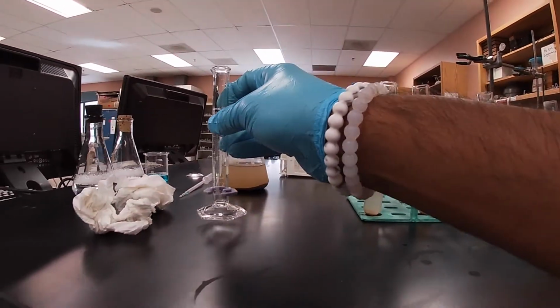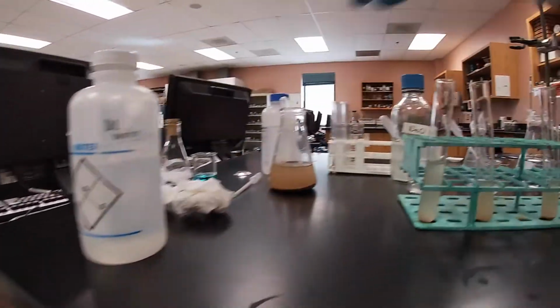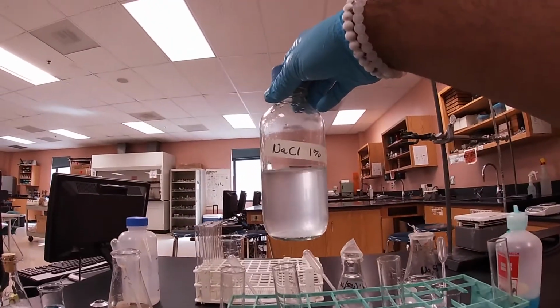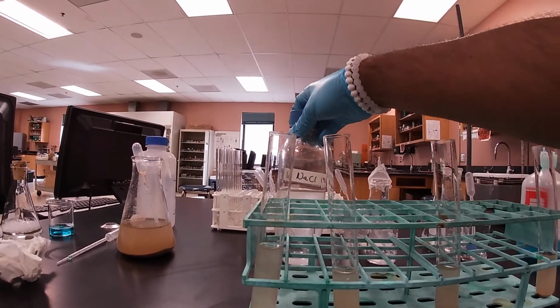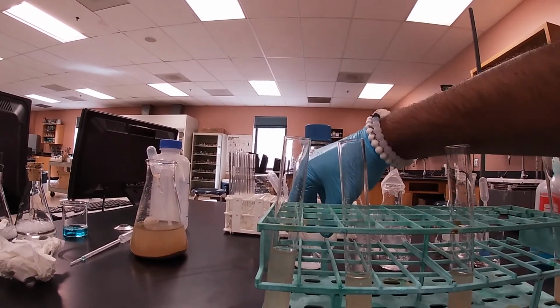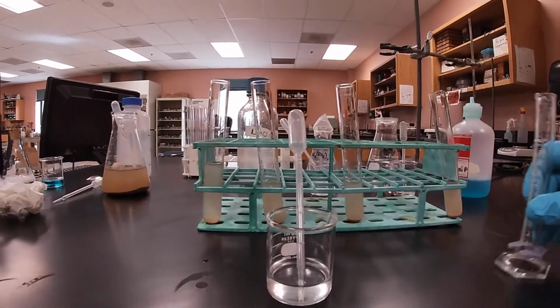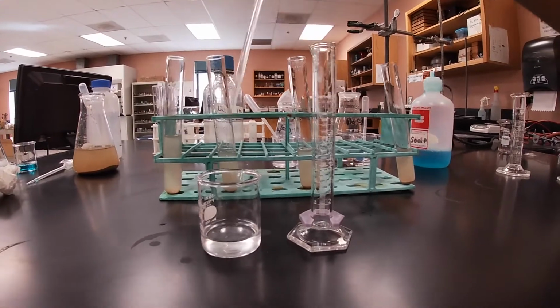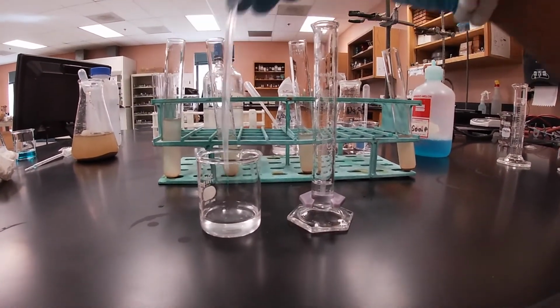And then we're gonna set this one aside. And the next thing that we're gonna do is measure out 5 milliliters of your 1% sodium chloride, right? So here we have sodium chloride. I've already extracted a little bit of that sodium chloride solution. So we're gonna measure out in our test tube 5 milliliters and add it to our second test tube here.